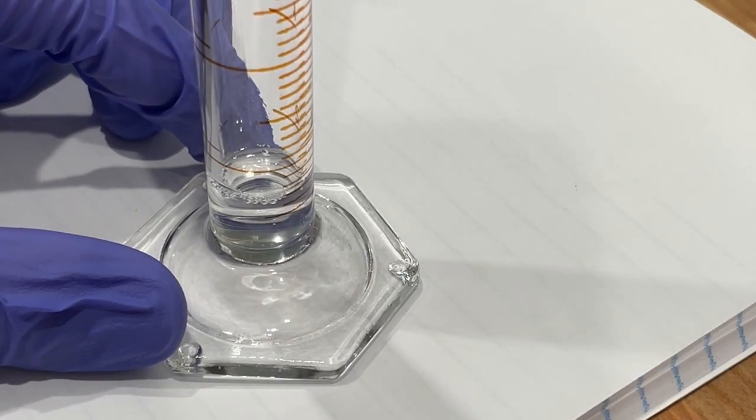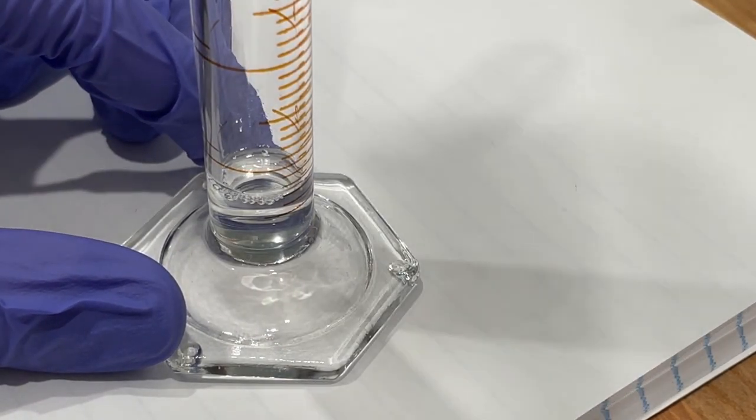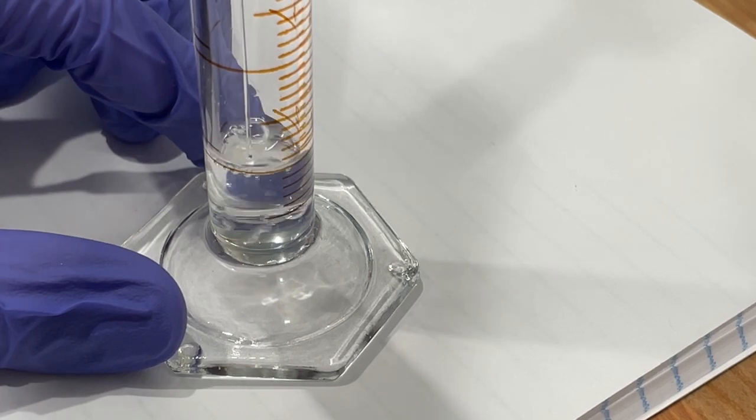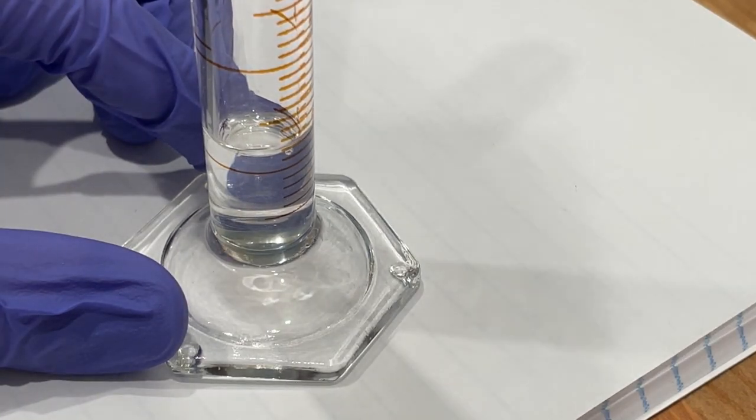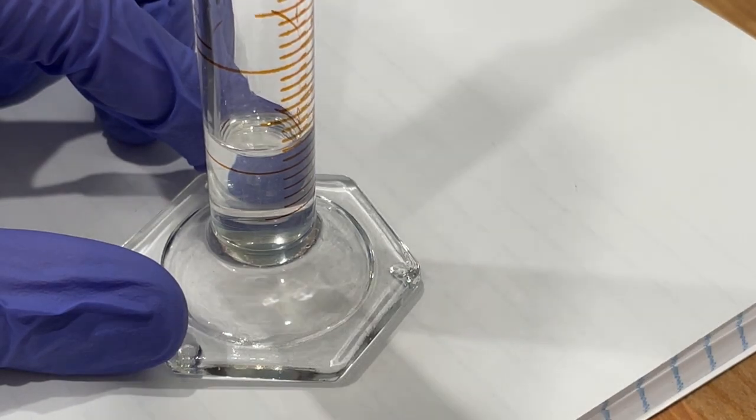I found that during these trials, the results varied drastically in terms of color, oscillation frequency, and how long the oscillations lasted for. For example, in this reaction, we can see the mixture darkening, but not going purple.